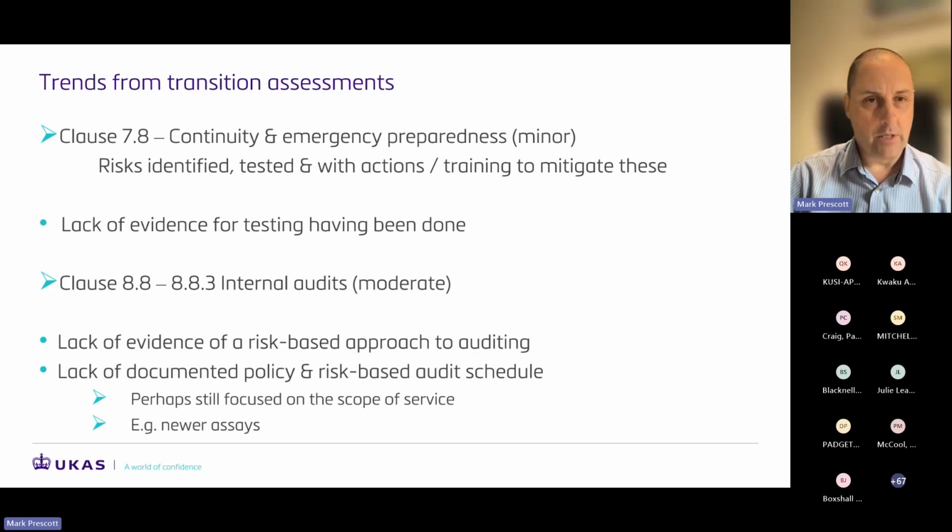So laboratories have contingency plans in place, but are not showing that they've actually tested all the key areas of it. And I do think this might be because, although it was in the 2012 standard, it was buried away a little bit under the lab director clause. So even though it's a minor change, it has been brought out into the open with its own dedicated clause, and so I think it's just getting that little bit more attention. It's a little bit more in front of you than it was before when it was within 2012.